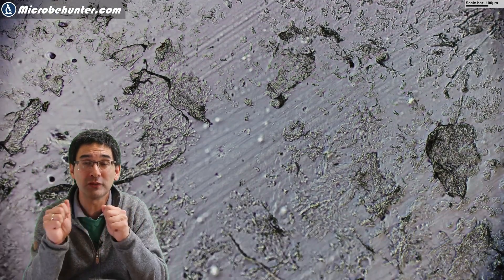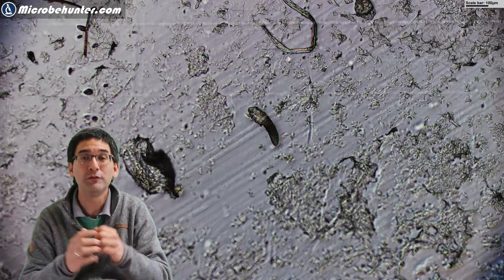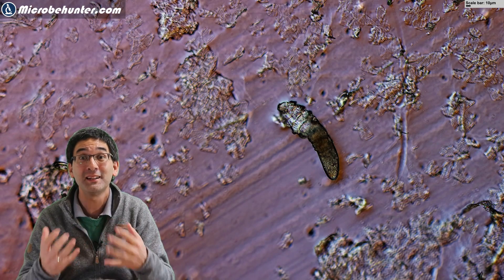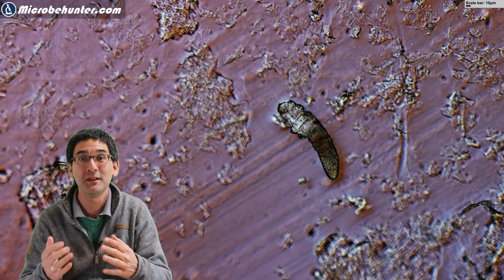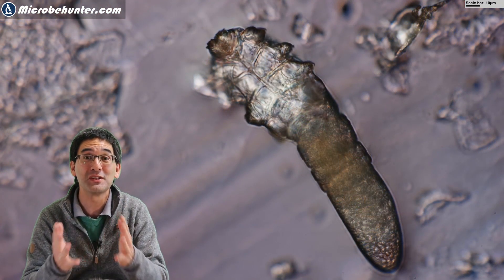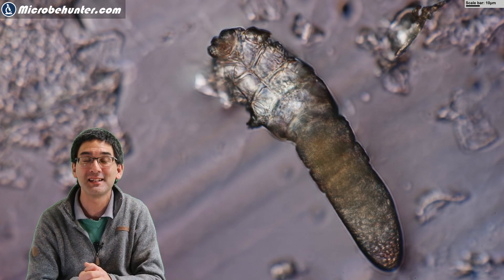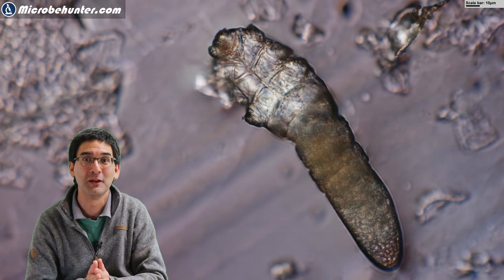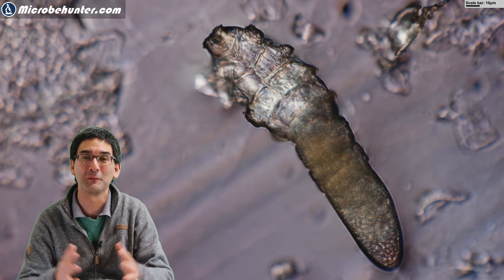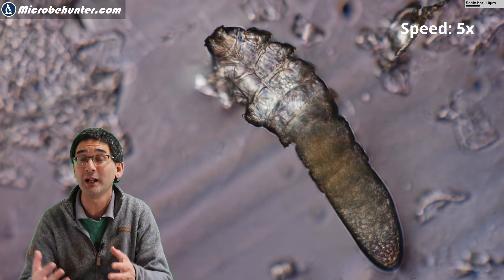If you look around a little bit you're going to see a lot of skin cells, dust fibers, and if you're lucky and patient you're going to find an occasional face mite that has found its way to the surface of the skin. I wanted to zoom in a little bit more for a closer look, and was able to see that it was actually still moving — of course with the back glued against the slide, the little legs in the air — and you could see them wiggle around and try to move, but of course no possibility to move forward.